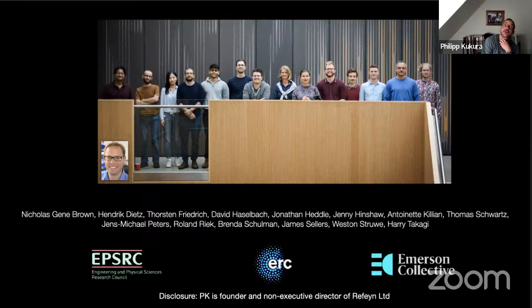Yeah. So I think some of these questions you can address if you have a FRET labeled system and you add ATP and you see how the FRET changes, you get information. What's really different, where I think our real strength is, and we see this in a huge number of systems that I wasn't able to talk about today, is where you have a multimeric, multi-protein complex, and you add ATP, what happens? The normal readout is, if I add this, I get high ATP turnover, and if I don't add this, I get low ATP turnover. And then here's a crystal structure, and I add this information together, and I make an interpretation.